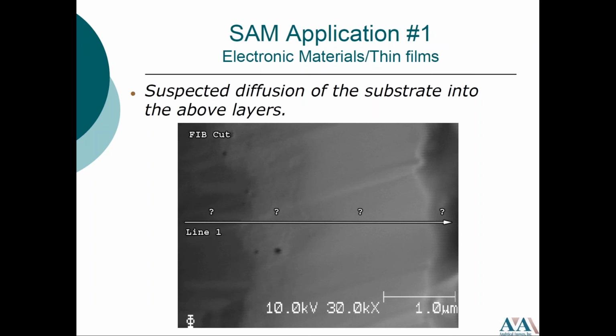Okay, we have another question coming in. This question states, can you depth profile down to a buried interface in an optical coating to look for contamination, and which technique is ideal for that scenario? We can depth profile down to an interface. The most important part of that question would be how thick the optical coating is and what type of contamination you're looking for.